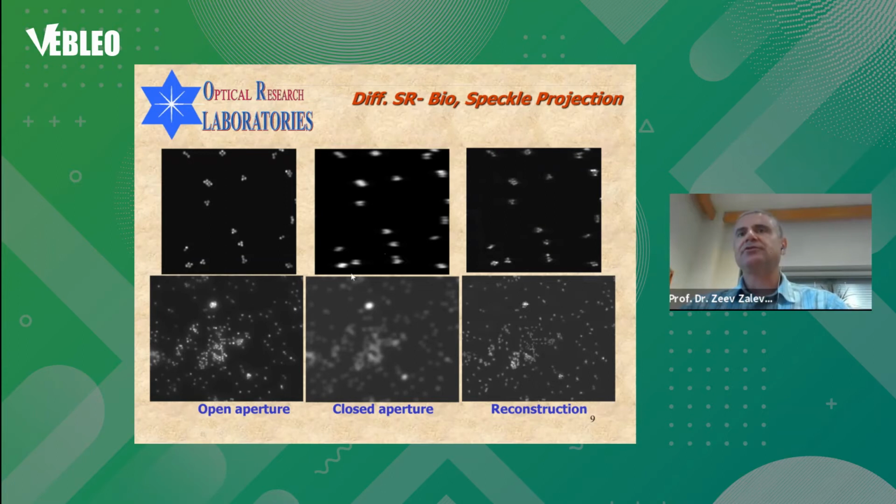In this slide, you see some experimental results applied for microscopy. So you see here two images having bunches of cells. You see this image and this image, those are the reference images. But when they are imaged through a low resolution objective microscope lens, these are the images we get. The bunch of cells are blurred. You cannot distinguish between the cells. You see they look like one spot, while originally there were, in this case, 6 cells.